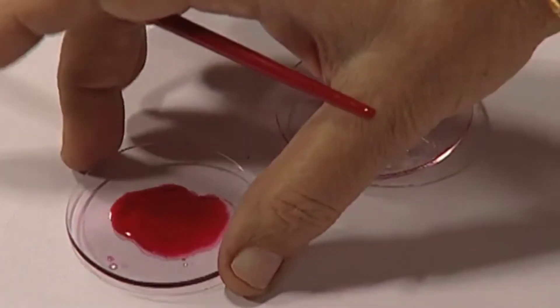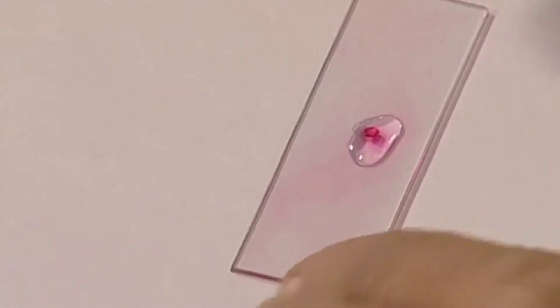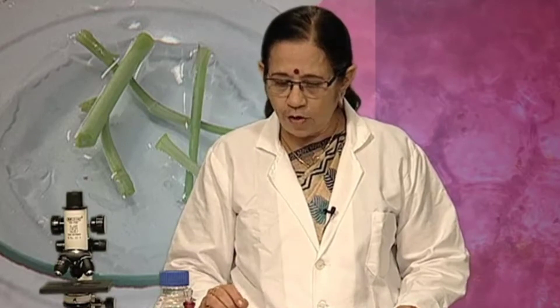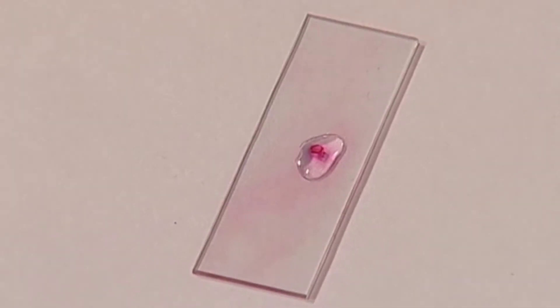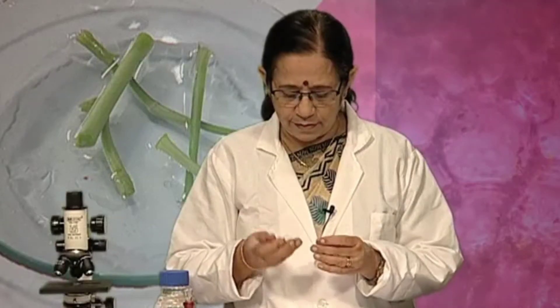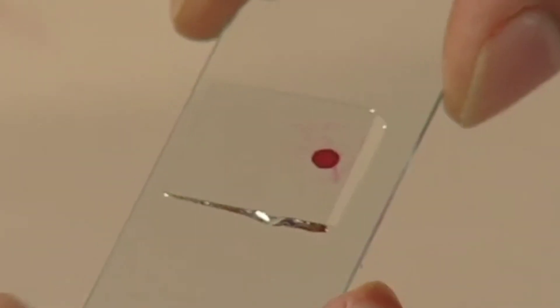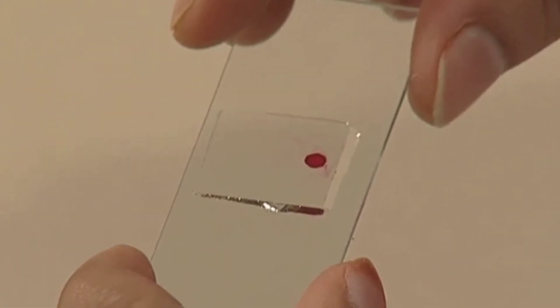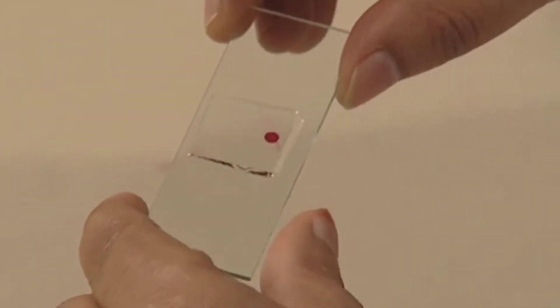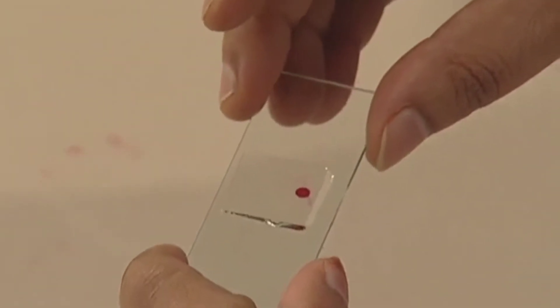After this, these sections are put on a slide. A drop of glycerin is put, and on this drop, the section is placed and covered by a cover glass. This stained section has been mounted in glycerin and is now ready to be observed under the microscope.